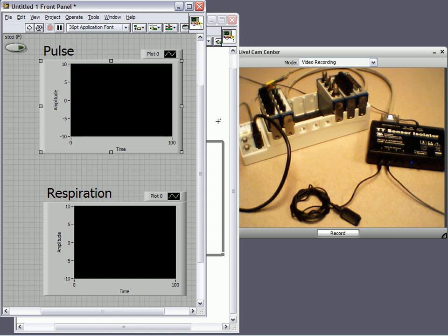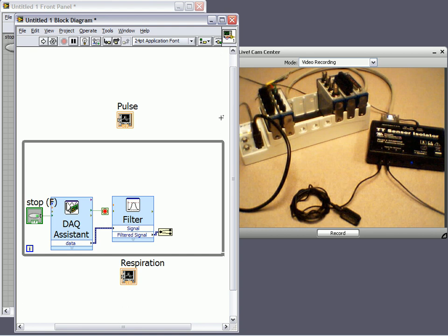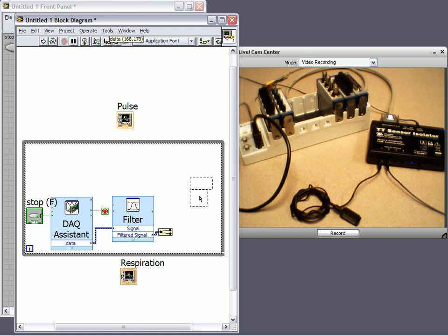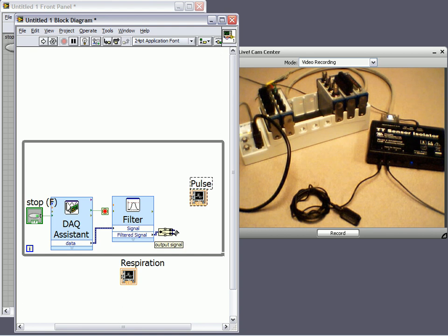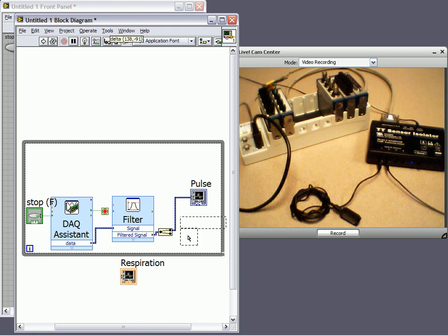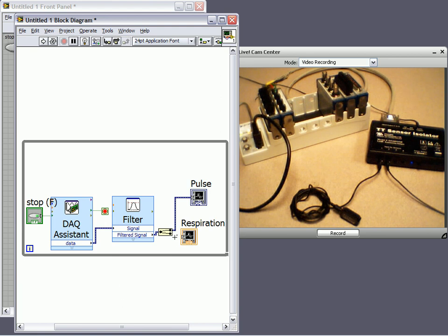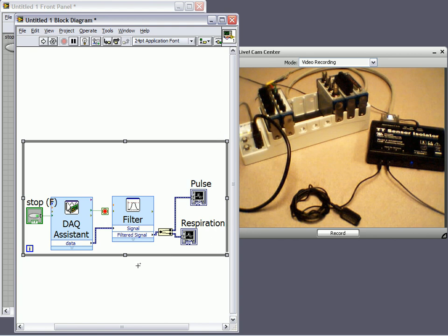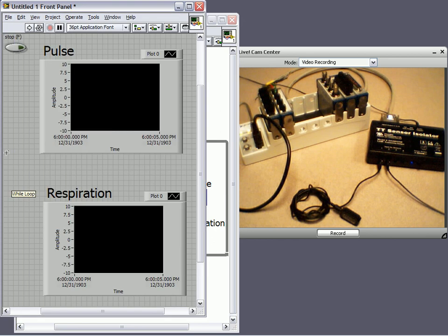Okay, if I go back to my front panel, I need to wire both of these. Okay, so pulse is going to be analog input channel 0, and respiration is going to be analog input channel 1. And now, our program is ready to run.